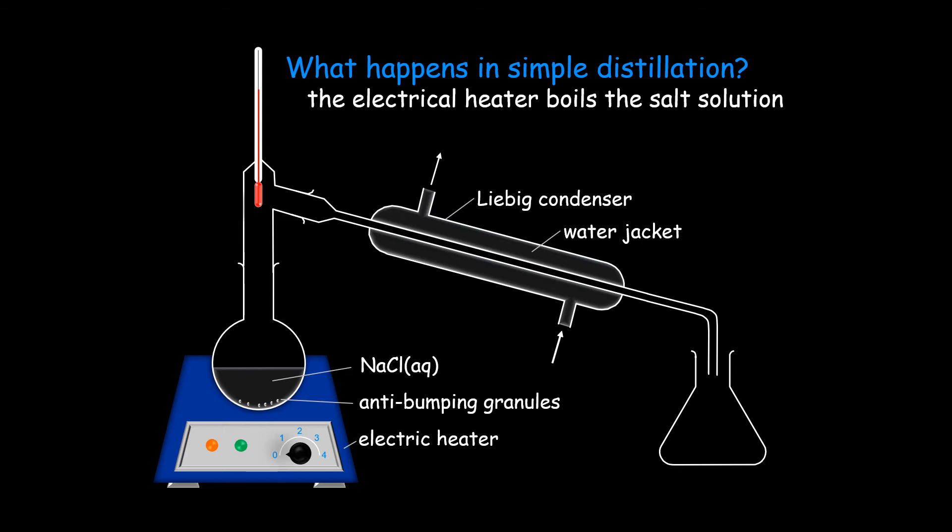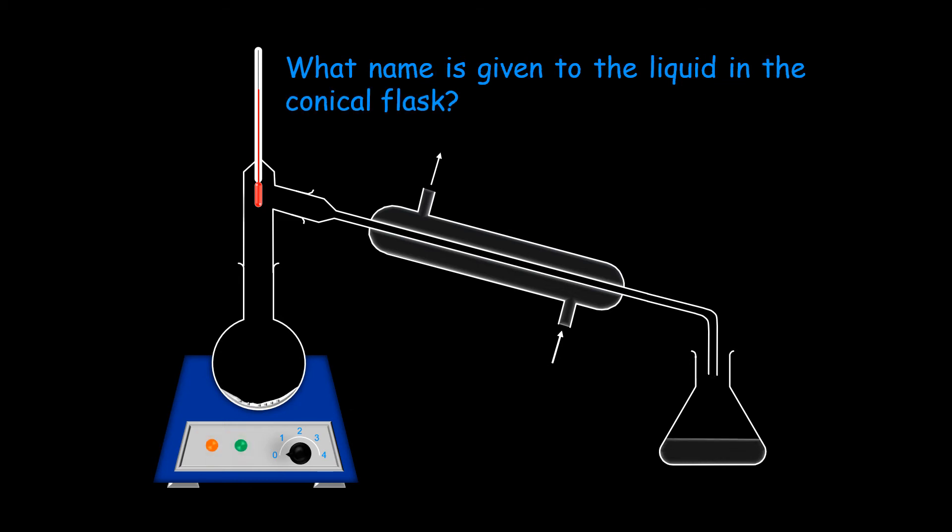The electrical heater boils the salt solution. Now our salt solution is boiling. The steam enters the Liebig condenser. The steam condenses and enters the receiver flask. The liquid is called the distillate and it's just pure water in this experiment.